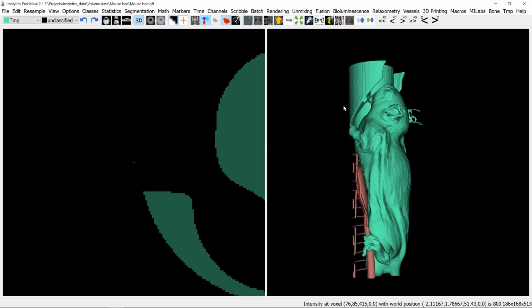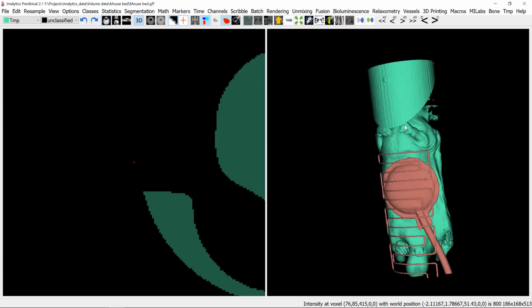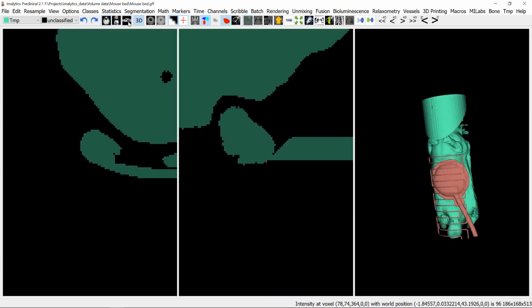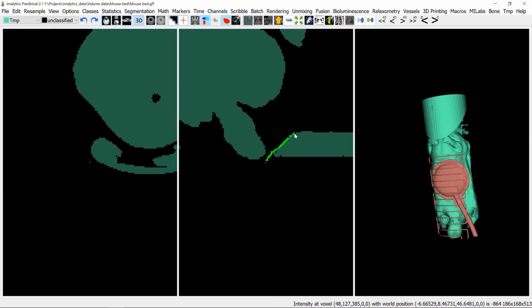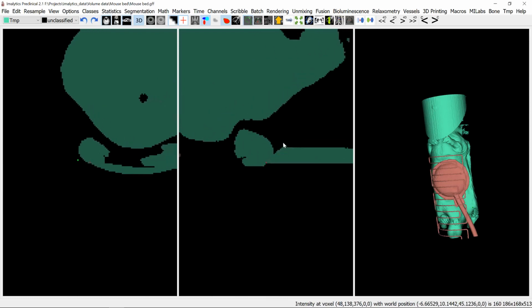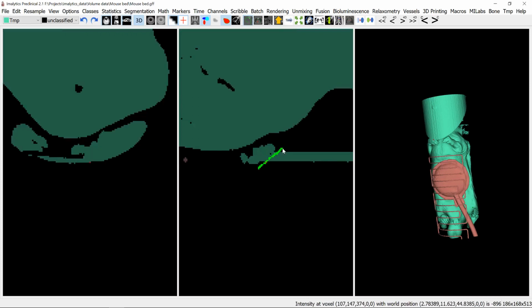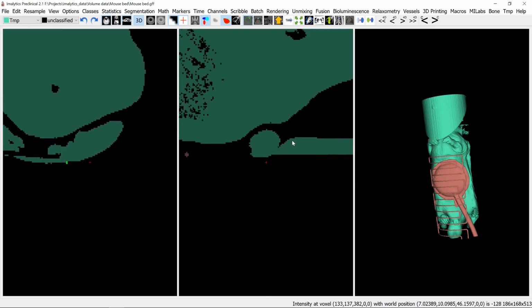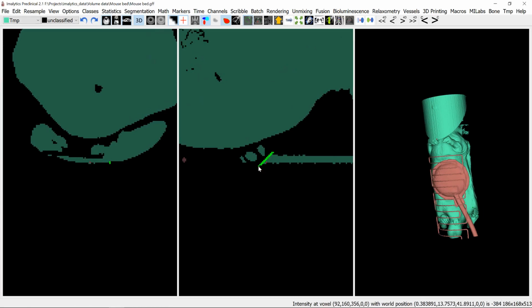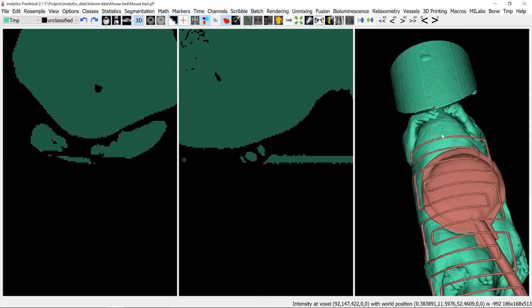Okay, now what about this part up here? So that is connected to the paws here, so let's use a sagittal view. Here we are, and let's just draw lines like this. On the other side as well, press F2 to clean it up. Let's jump to the other paw, this direction, the other direction, press F2. So we made some cuts here.